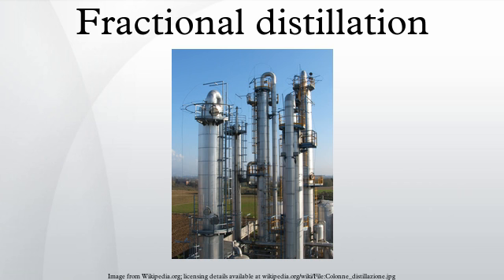Alternate setups may utilize a multi-outlet distillation receiver flask to connect 3 or 4 receiving flasks to the condenser. By turning the cow or pig, the distillates can be channeled into any chosen receiver. Because the receiver does not have to be removed and replaced during the distillation process, this type of apparatus is useful when distilling under an inert atmosphere for air-sensitive chemicals or at reduced pressure.